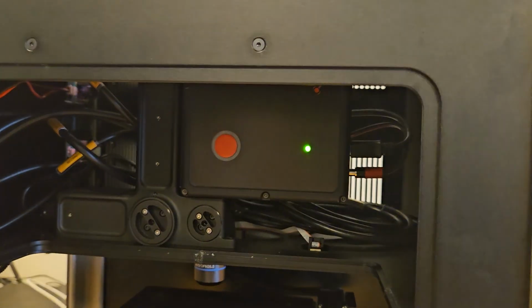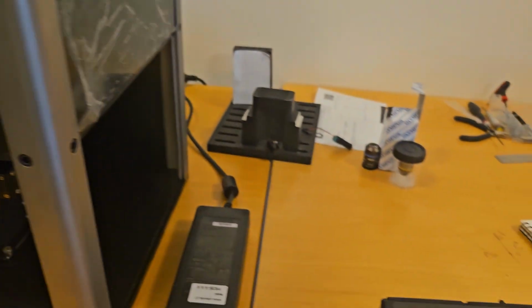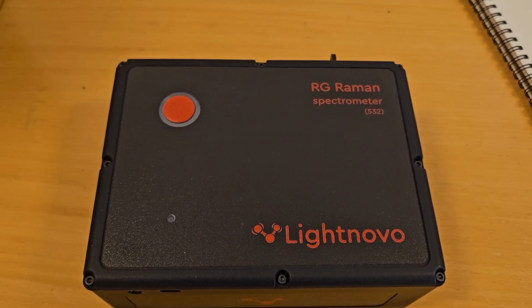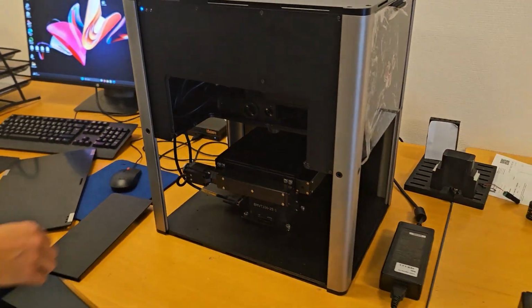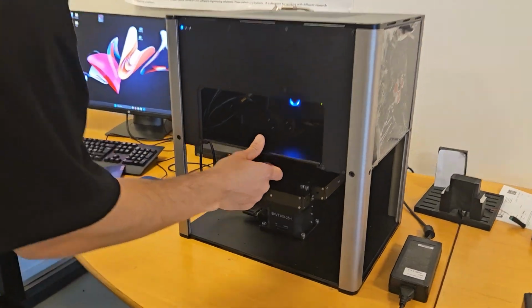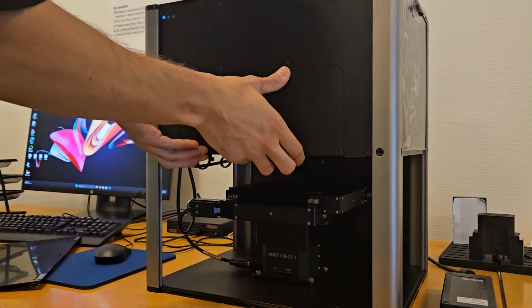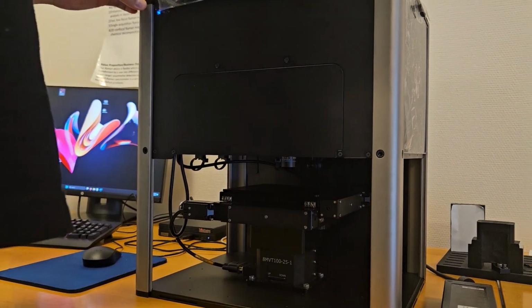spectrometer. This current spectrometer is 785 nanometers, but we also have another option, for example, this 532 nanometer spectrometer, and they can be easily swapped by this axis from the top. So Pascalis, could you please assemble everything back? Yes. And we'll demonstrate the functionality of the software and the principles of how to measure the samples.